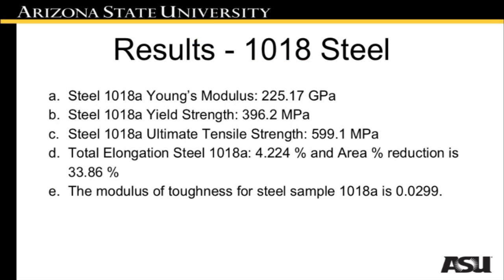Many different properties can be determined from the stress-strain curve. Here we see the Young's modulus, yield strength, ultimate tensile strength, percent elongation, reduction in area, and toughness for a sample of 1018 steel.